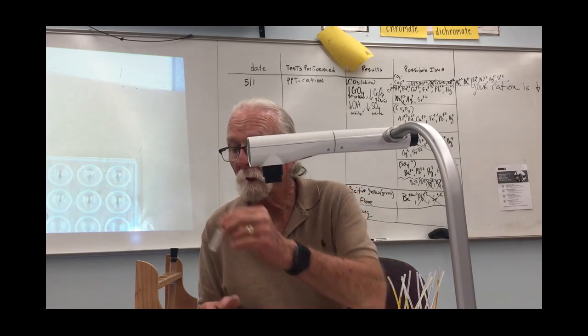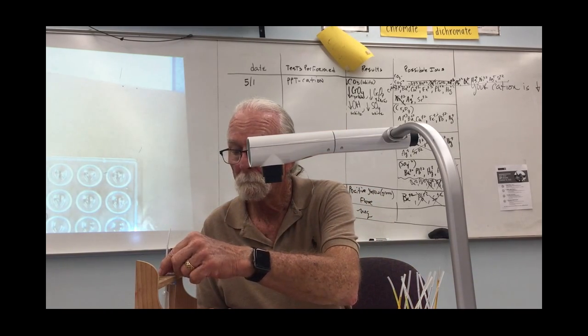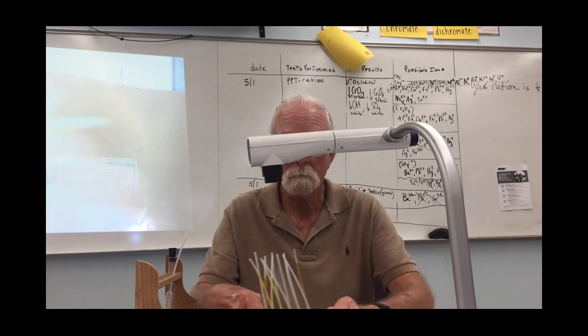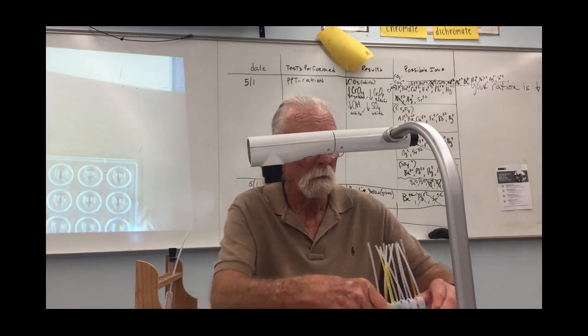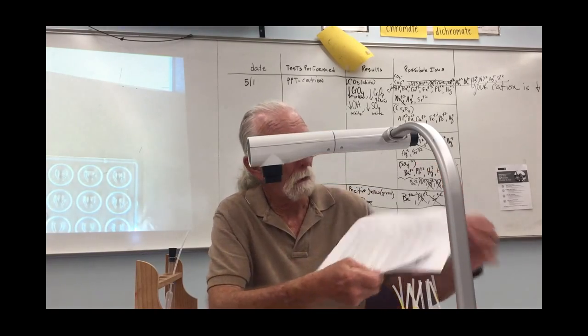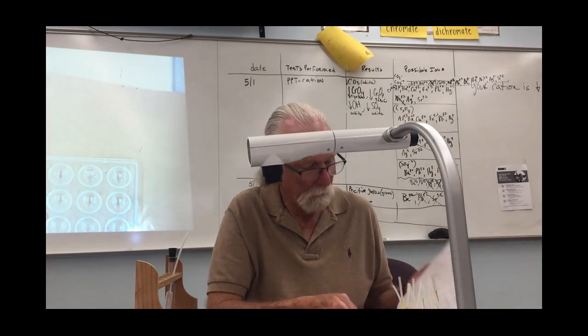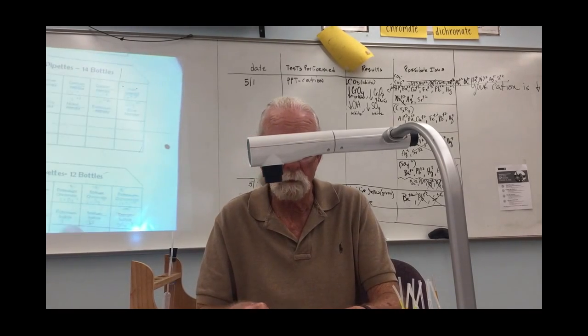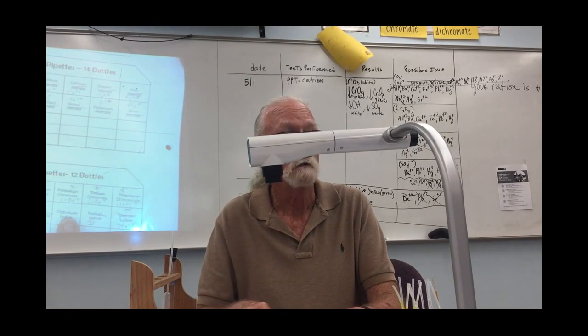I should have 12 drops there, because there are how many reagents in this? 12. And these reagents are right here. Oops, sorry, right here. So I'm working those.